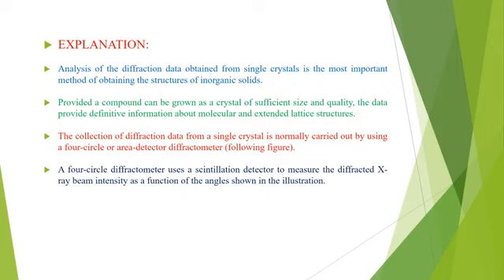The collection of diffraction data from a single crystal is normally carried out using a four circle or area detector diffractometer, which is shown in the coming slide.